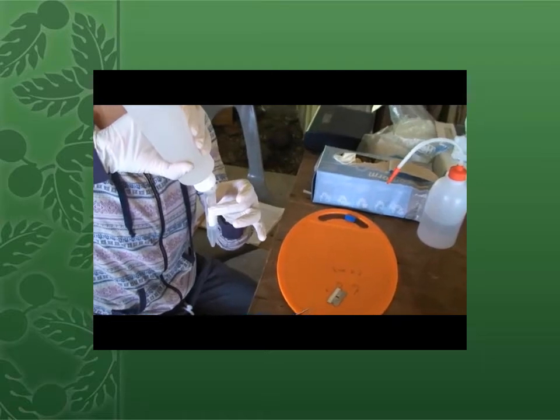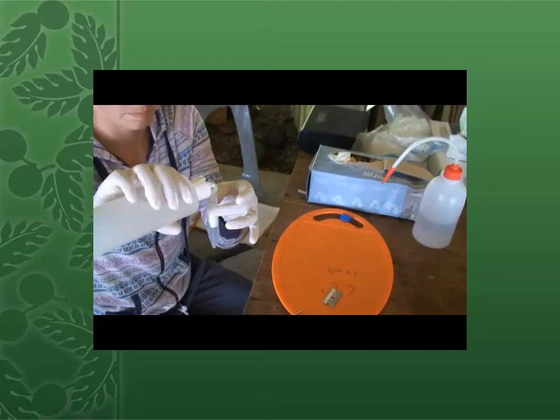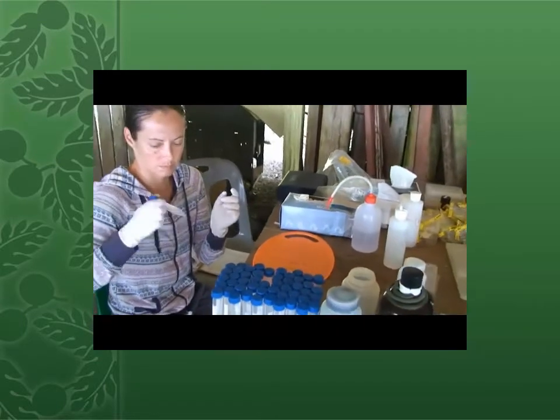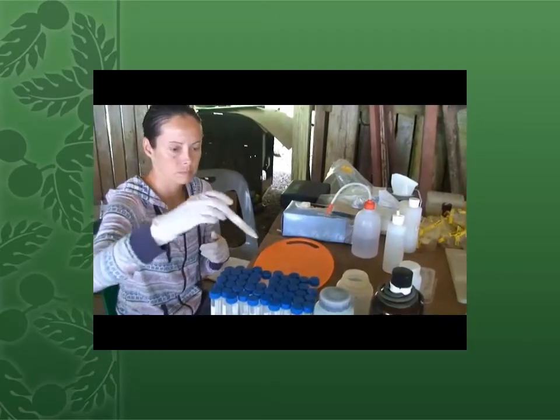Add a solution called Gilson's fluid that's going to help liberate the eggs from that ovarian sample. Cap it off and store it away.